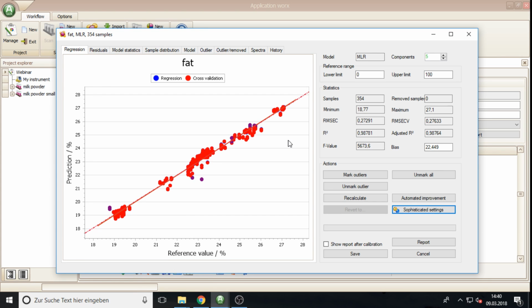an easy predictable product. For example, alcohol in wine might be, if it's just some special kind of wine, just red wine of the region of Bordeaux, might be easy enough to build the calibration up on fewer samples.